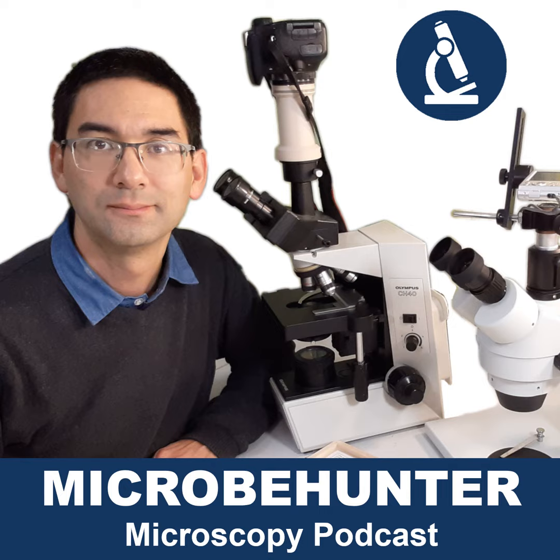I would like to answer another question from one of my YouTube viewers. The question is as follows. What if I want to take images with my laptop using the microscope? I also want the microscope to have a screen. Now that's an interesting one because there are actually two different issues here that I want to talk about.